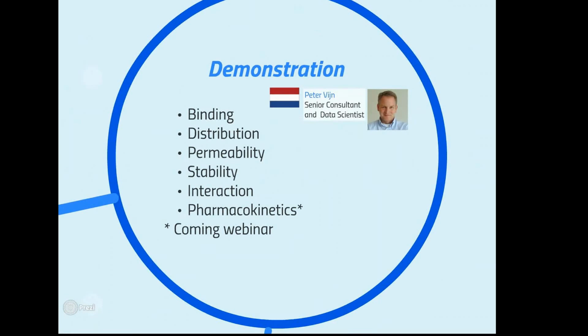Today, we're going to cover most of the in vitro areas with example data analytics templates. We won't be covering specifically in vivo pharmacokinetics today, but it will be the subject of a future webinar. So with that, I will hand over to Peter.